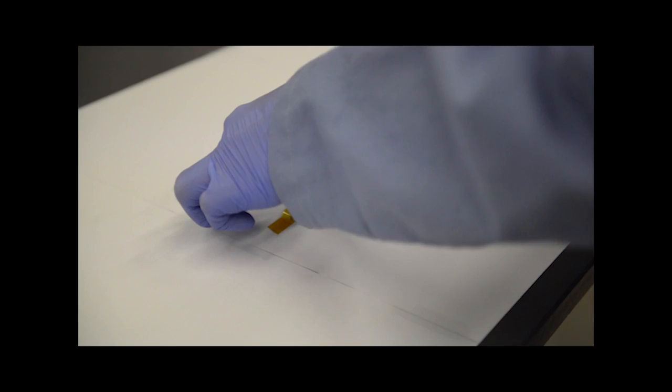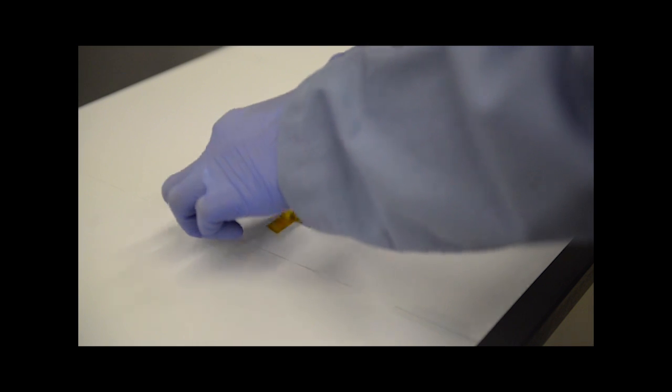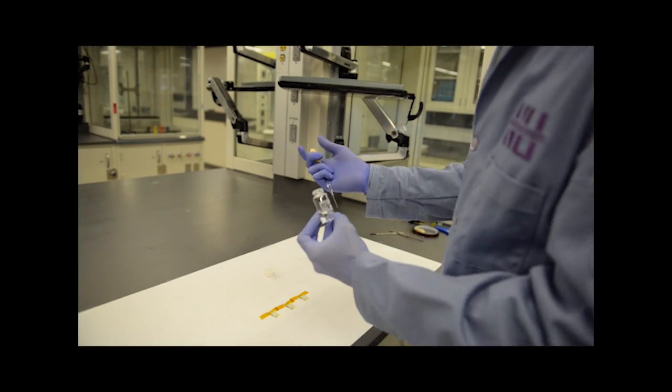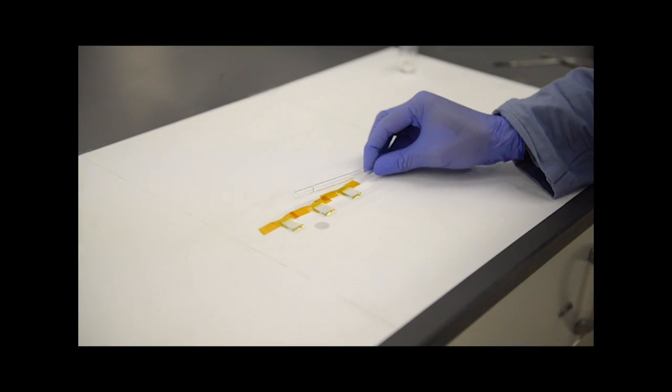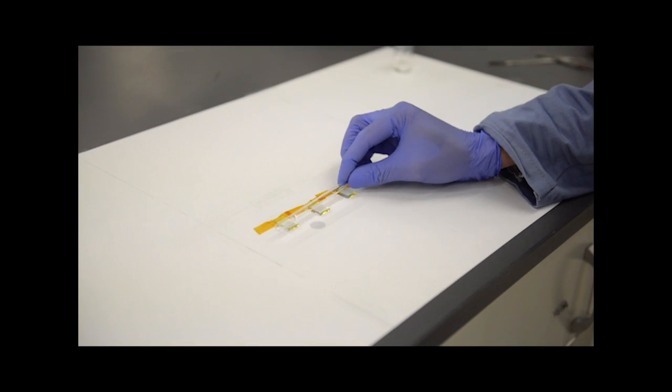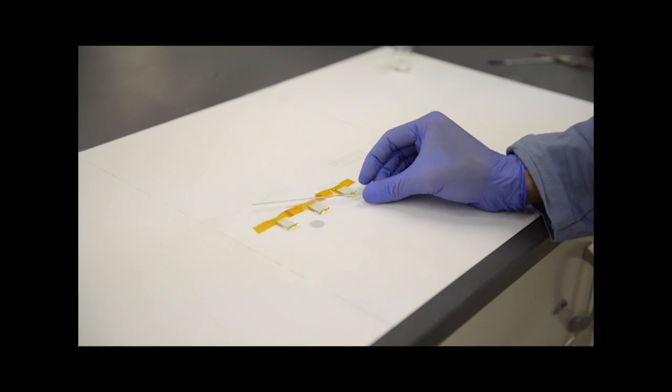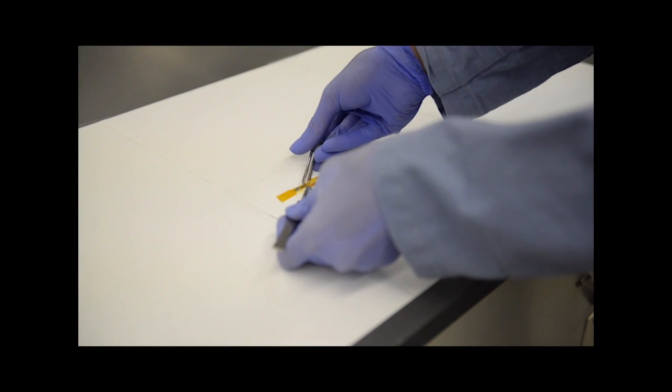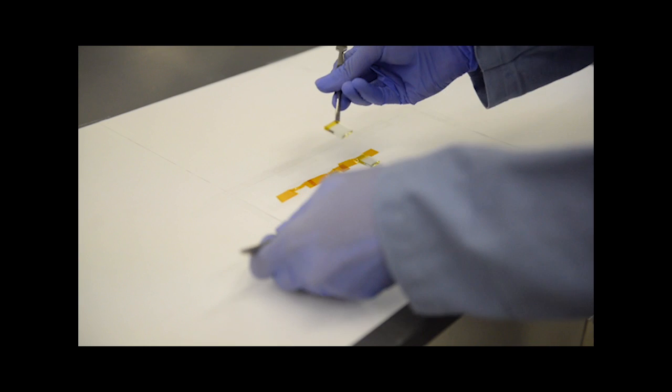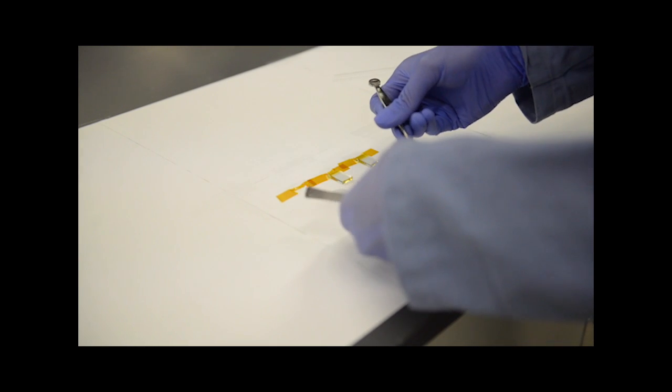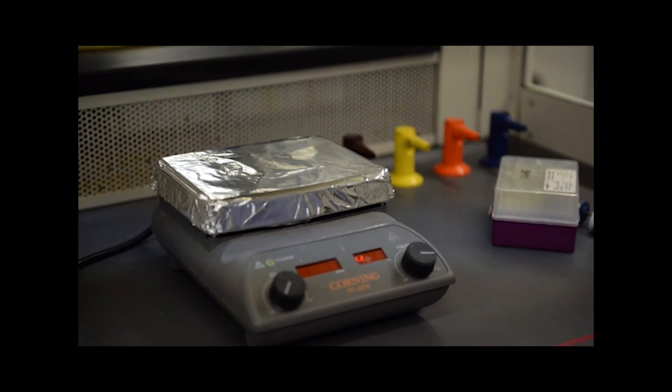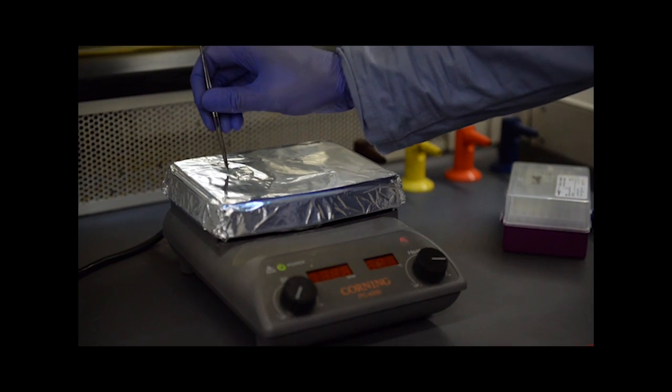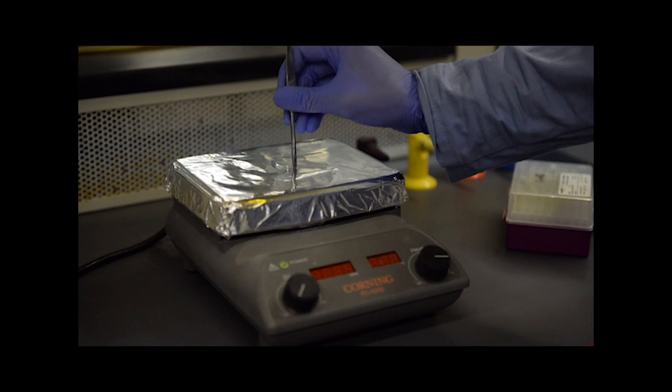To deposit the titania layer, place the FTO glass on the bench top with the conductive side facing up. We deposit one drop of titania solution onto the glass and spread it across the surface with a glass pipette. Then we remove the tape entirely and place the glass piece on a hot plate facing up. We heat it at 450 degrees celsius for about 20 minutes and let it cool down for about 10 minutes.